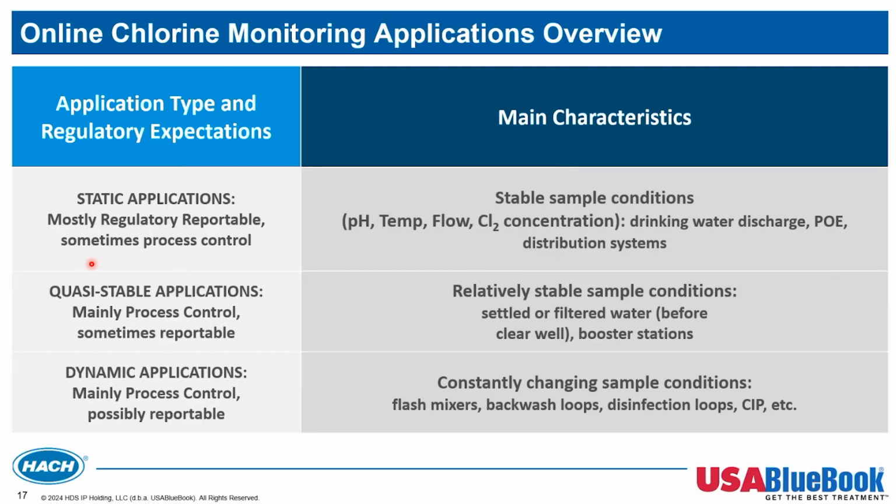And those applications are mainly regulatory reportable applications, such as point of entry, etc. Now, there are quasi-stable applications when the conditions may change, not necessarily fast, but they may change, such as settled water or filtered water before the clear well.